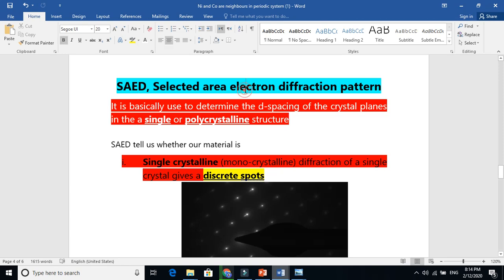So, selected area electron diffraction — why are we doing this analysis? It is used with TEM analysis. When we further zoom in and bring it to the diffraction mode, it gives us these diffraction images. This characterization tool is basically used to know whether your material is single crystalline or polycrystalline.